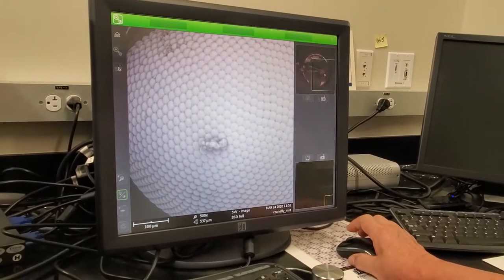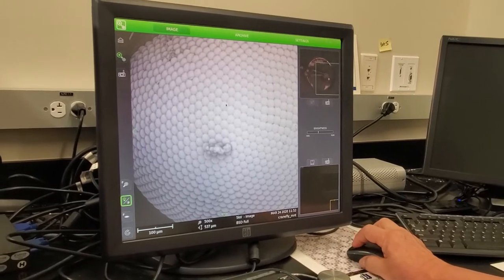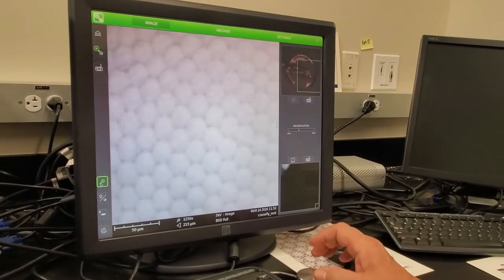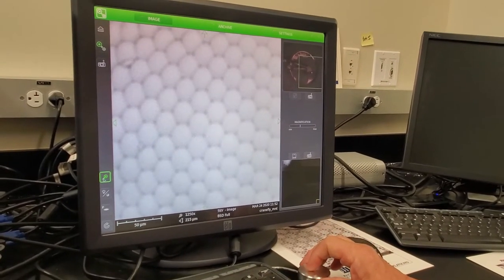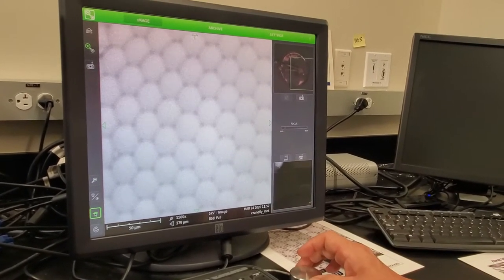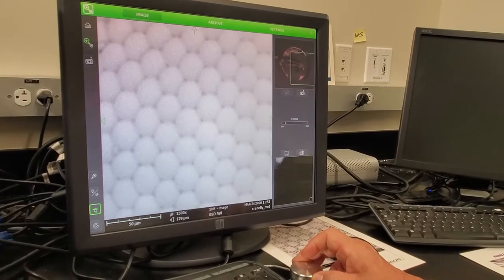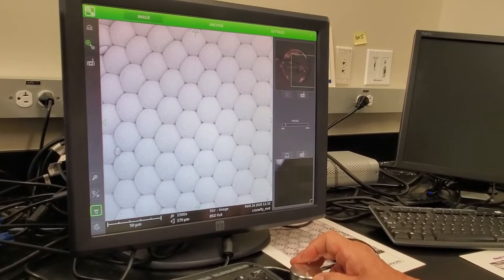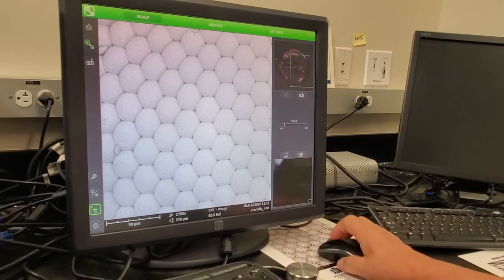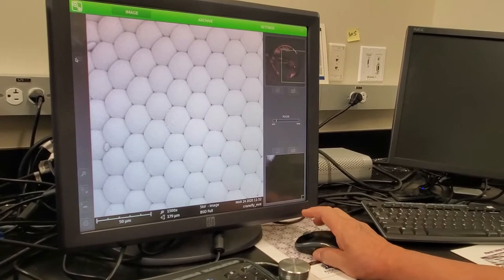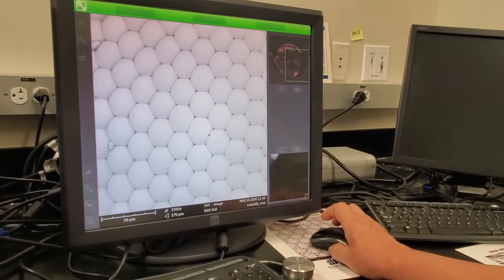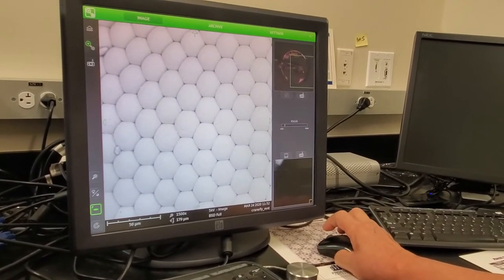Now remember what Dr. Ramakrishna says about packing — six on one. Take a look. I'm going to zoom in a little bit more. Let's bring it up to about 1500. Now focus. They look hexagonal — one with six around it. Well, it's a circle, so hexagonal is a good packing arrangement. And then find focus and take a picture. Pretty cool, huh? That's what it looks like at 1500x.